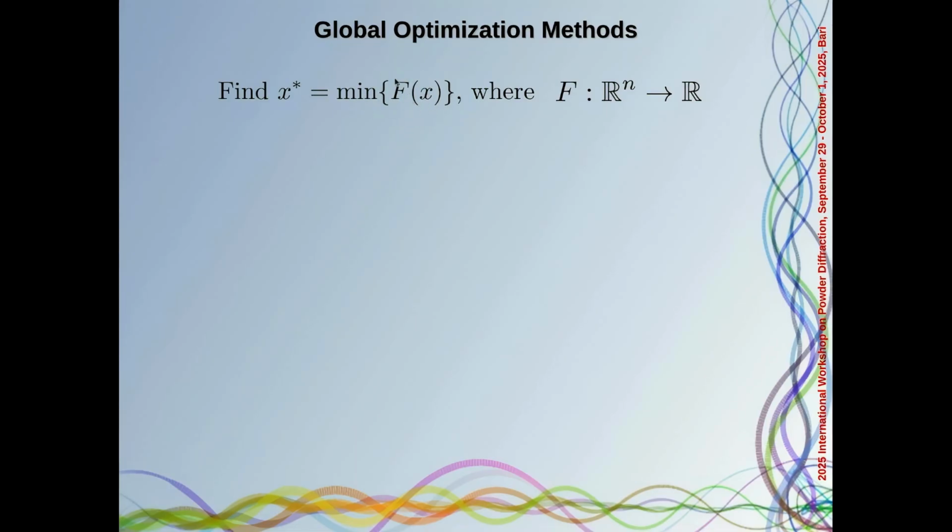So we can see the problem of structure solution as an optimization problem, where the variables are the fractional coordinates of your model. But there is a better approach, in particular to reduce the number of variables.